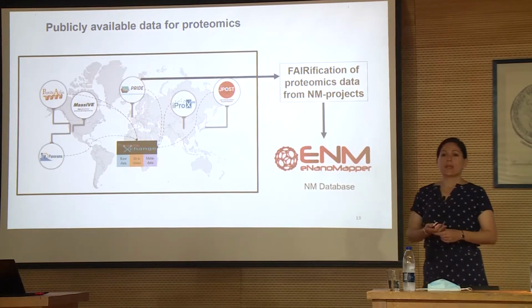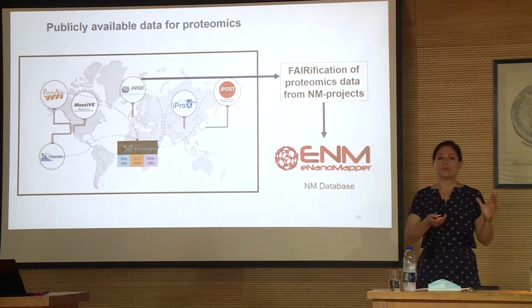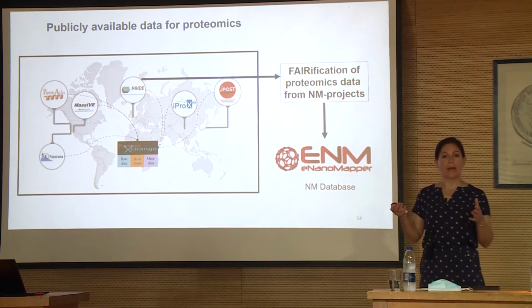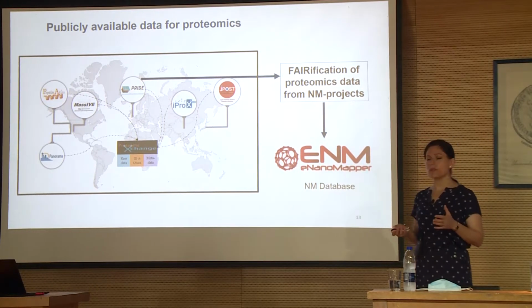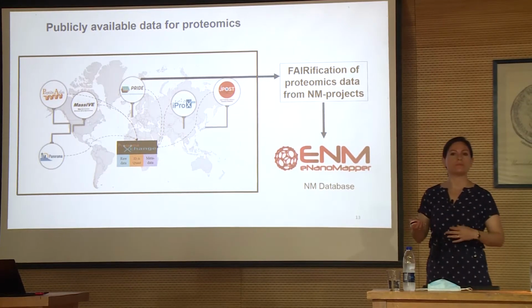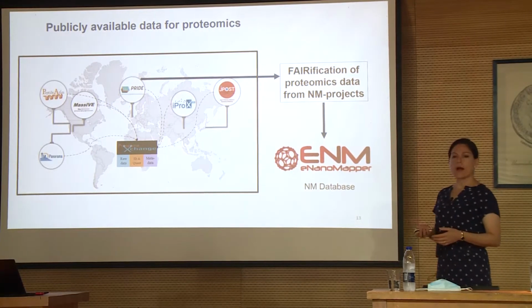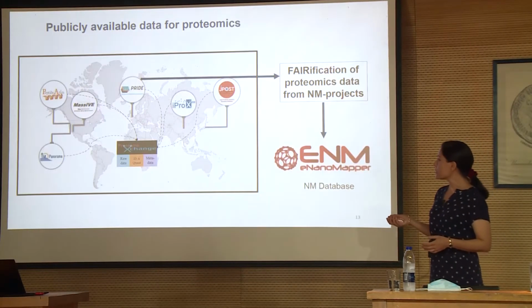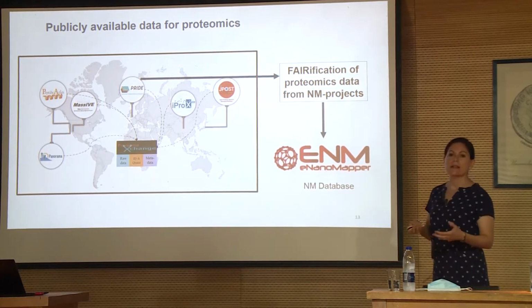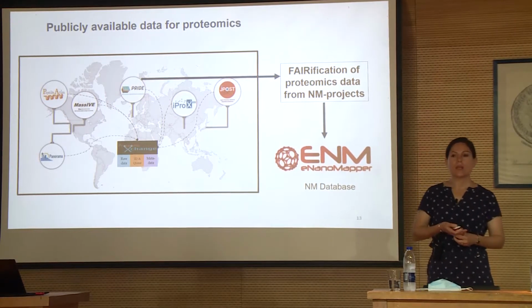So, I come back to what I said I would do: I try to have these descriptors for nanomaterials and descriptors for lung alterations. So the first thing we did was to look for a repository where we could find this data. And among the many that are there worldwide, we considered PRIDE the one that we liked to start with.